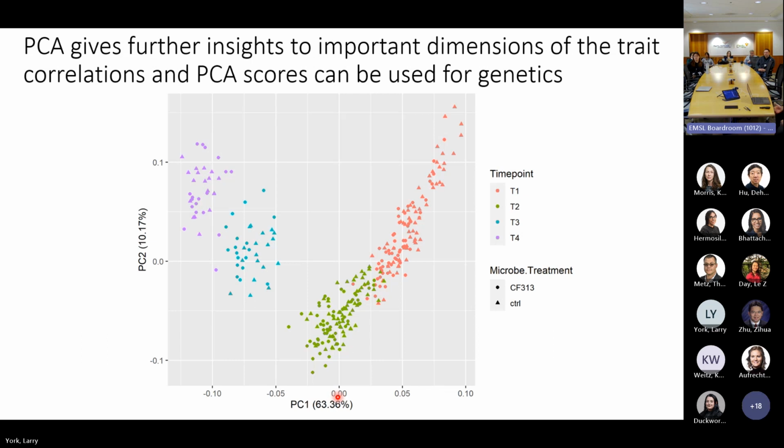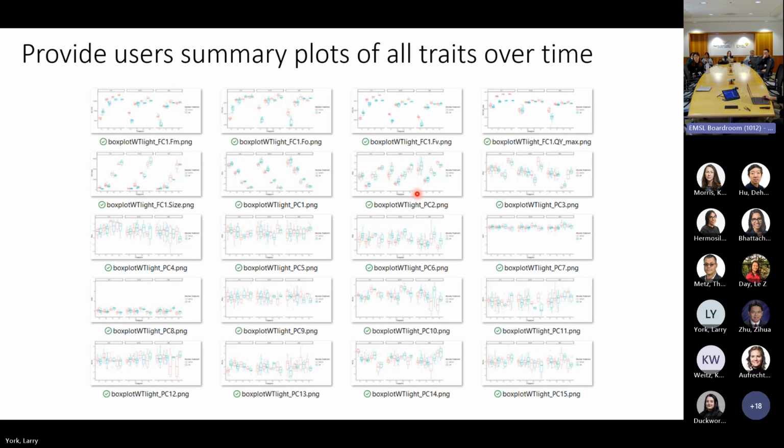Getting into how you handle the multivariate data, this is very sensitive to picking up the time points. So you can pick out plant age quite easily, not only from size but also from the spectral signatures. But when we color code by circles and triangles, that doesn't pull out as much here. Then again, PCA is not really meant for clustering, despite that people almost always show it as if it is. It just shows you the maximum components of variation, with no knowledge of the factors involved.